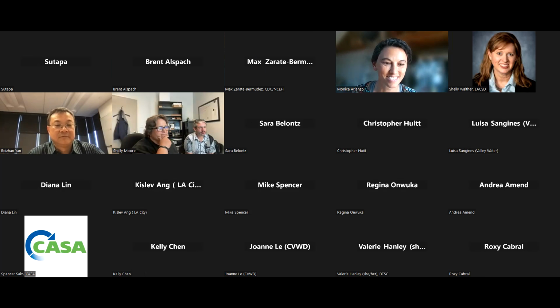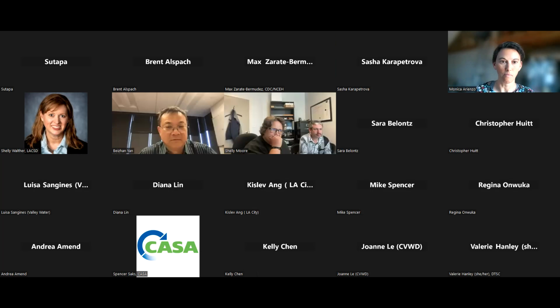That was a great presentation. I really enjoyed it. I was wondering, you said that you can go down to a much lower size for detection. Typically, I think with Raman, we have gone down to about a micron, but the Raman that you are using, the results that you showed, they are 500 nanometers. That's about half a micron. Is it possible to go down even lower?